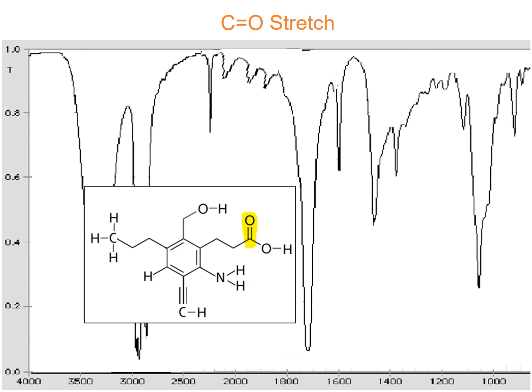Then coming to the most important type of peak, the C double bond O stretch. Many people start interpreting an IR spectrum from this CO stretch. They look for the presence or absence of this peak, and perhaps this is the most prominent type of peak observed.